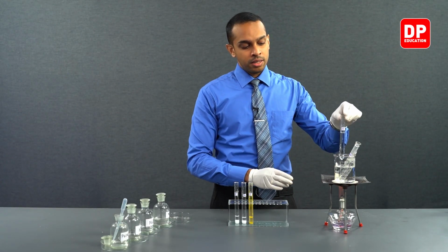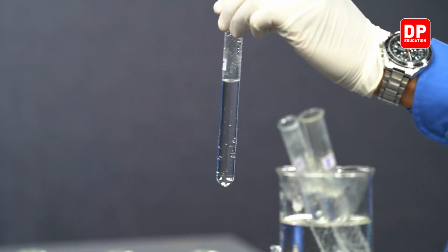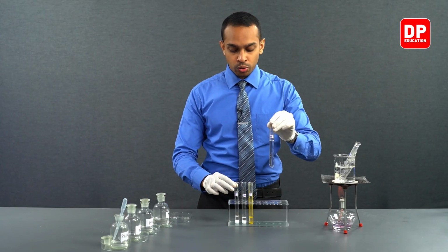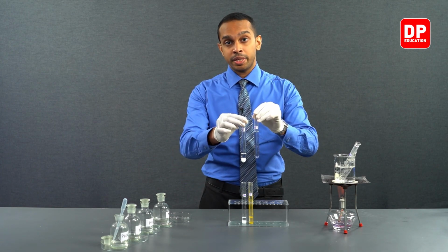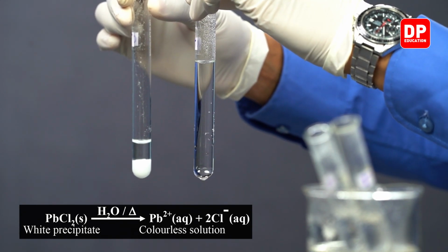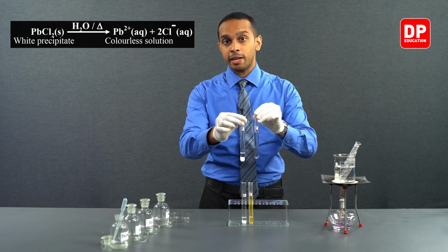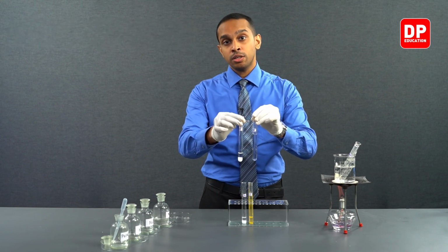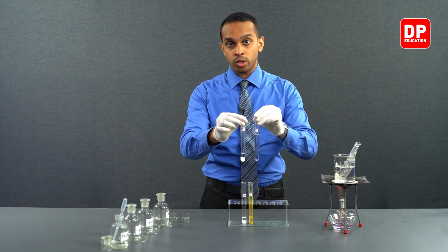If you take the lead chloride precipitate, it has now completely dissolved in hot water. For comparison, the lead chloride precipitate before heating was a white color precipitate. After heating it with water, it has turned into a clear solution. So this is evidence that you can take lead chloride precipitate and dissolve it in hot water.